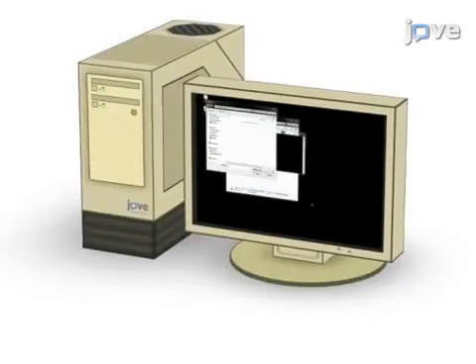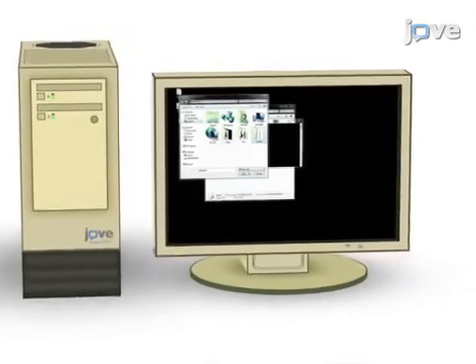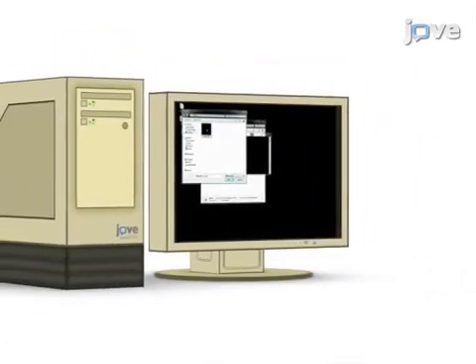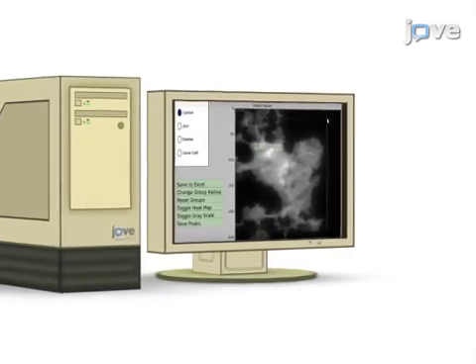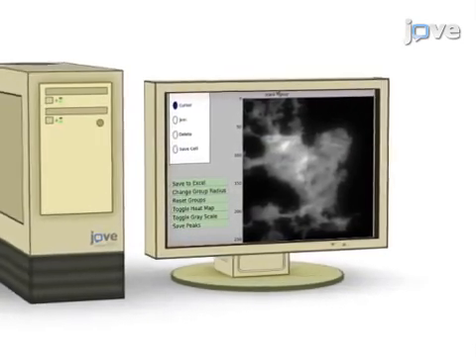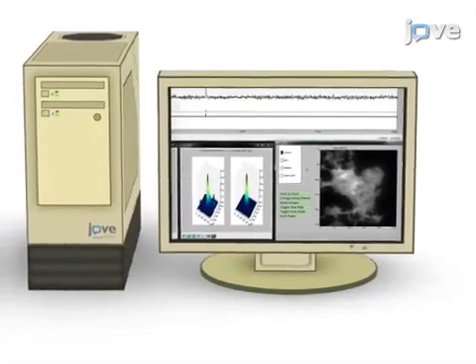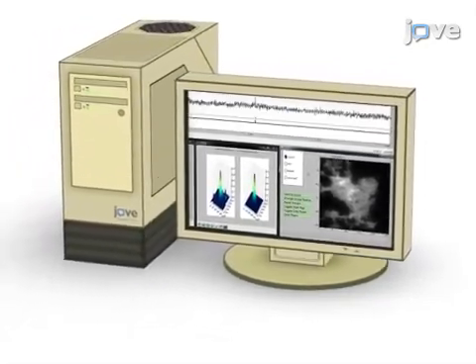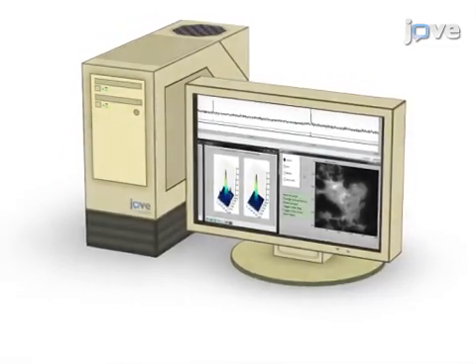The final step is to import the image stack into the custom-written algorithm to initiate the automated analysis of the recorded data. Ultimately, the algorithm rapidly localizes sites of calcium release with sub-pixel resolution, allows user review of data, and outputs time sequences of fluorescent ratio signals together with amplitude and kinetic data in an Excel-compatible format.